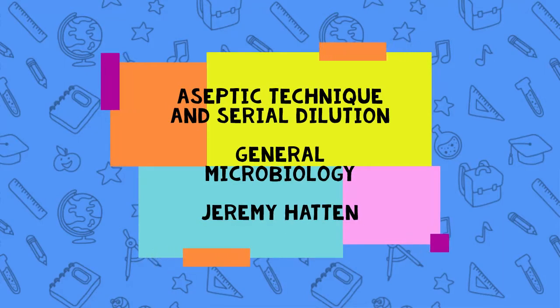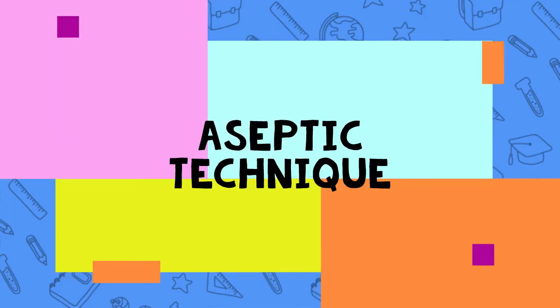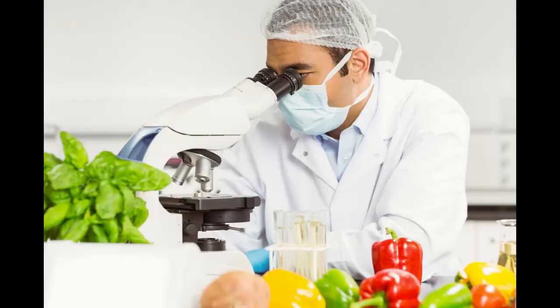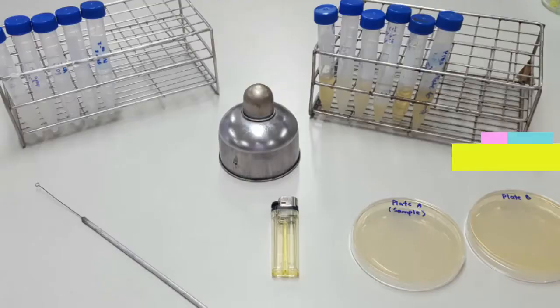Today we're going to be learning about aseptic technique in the laboratory, as well as how to perform a serial dilution. We use aseptic technique in many different settings to prevent the contamination of microorganisms. Within food science, this is used to avoid spreading pathogens. Now we're going to walk through the steps for transferring a bacterial culture to a medium without contamination.